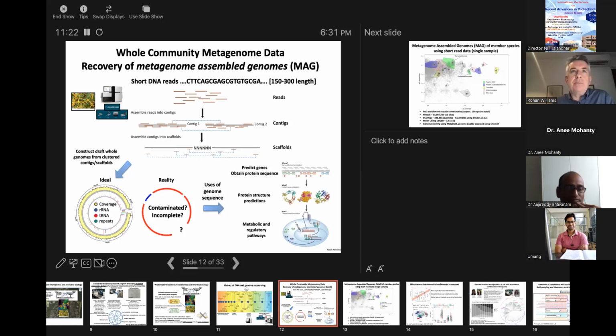And then if you're lucky, you can start piecing these slightly longer fragments together into longer ones again that we call scaffolds. The idea is that you take scaffolds which, under a set of analytic criteria, are likely to arise from the same genome and reconstruct an entire genome. In an ideal world, this is what it will look like. It would be a continuous chromosomal sequence. It would have all the right kinds of ribosomal genes, or the requisite number of tRNA genes and so on, and you'd be able to sequence all the repeat regions and construct a single sequence. But in reality, it's not that simple.